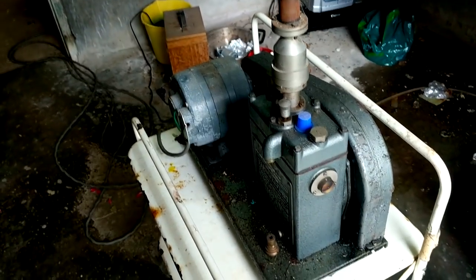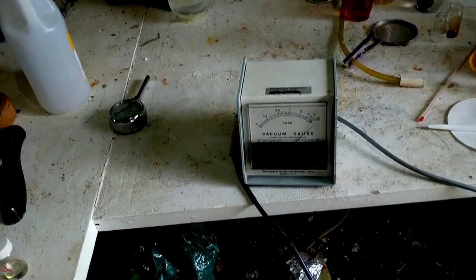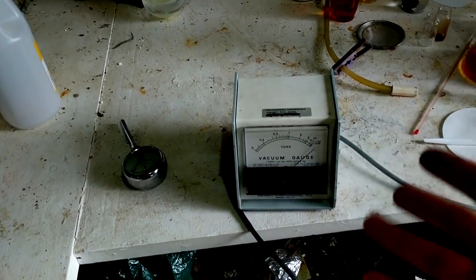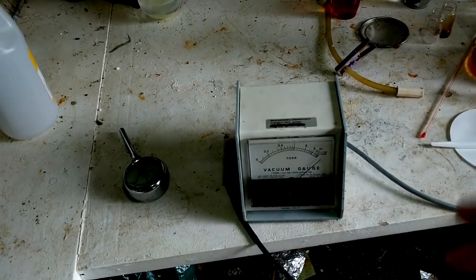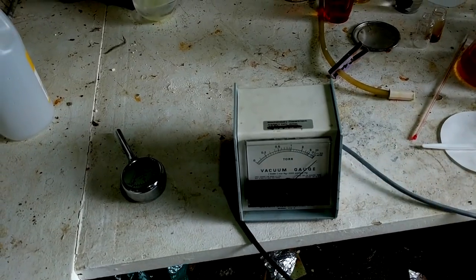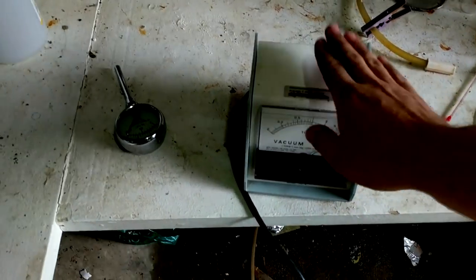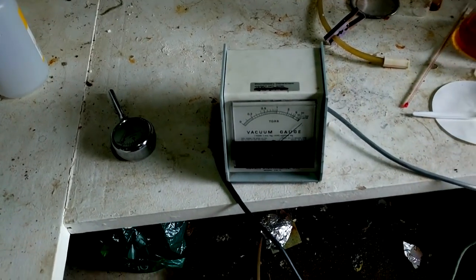I'll turn it on and measure the vacuum with this brand new acquisition — a vacuum gauge I picked up yesterday from a lab at my university, an old workshop being completely scrapped. They were getting a skip in and throwing out all the scientific equipment because the university can't use equipment that's been out of service too long — it's a liability issue and they don't have the space to store it while it's getting fixed. I also picked up a centrifuge. The university just let people come in and take things.